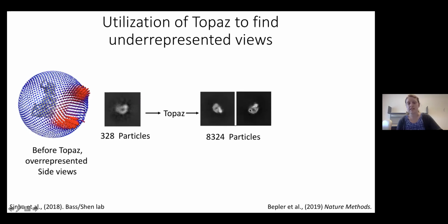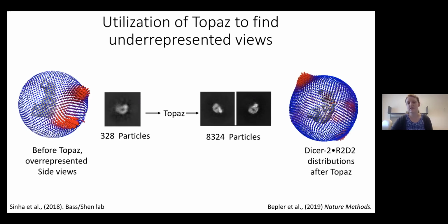We're able to see the traditional C-shaped helicase domain with an additional density on the helicase domain that we've now attributed to R2D2. We can even start to see some secondary structure within this class, which we had not previously seen in the helicase 2D classifications.